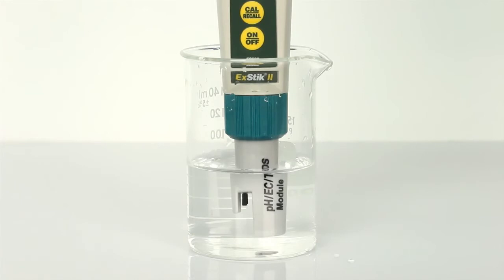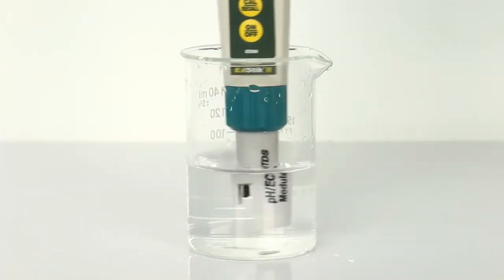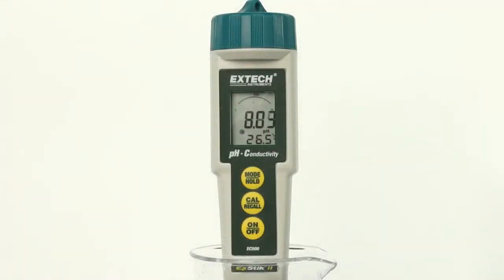If in conductivity, TDS, or salinity mode, slowly stir to remove air bubbles. The meter will auto-range and then display the reading.